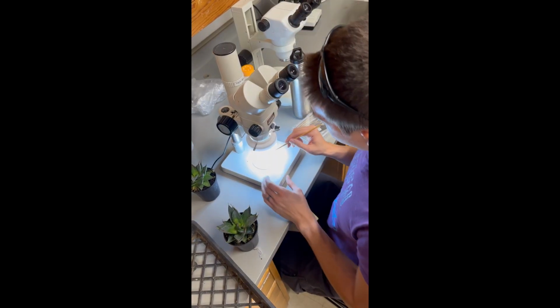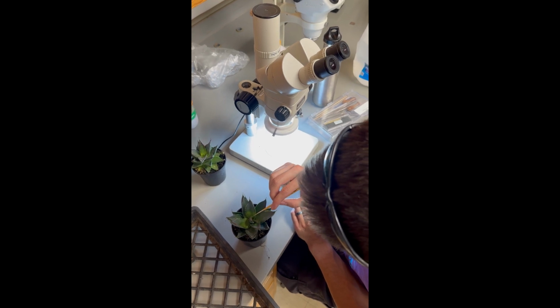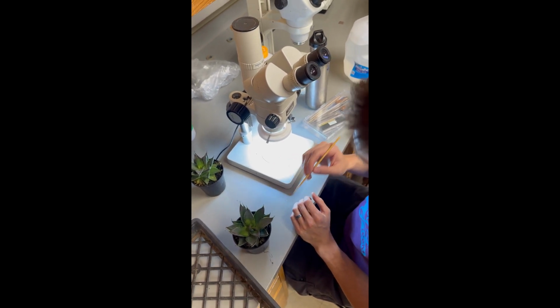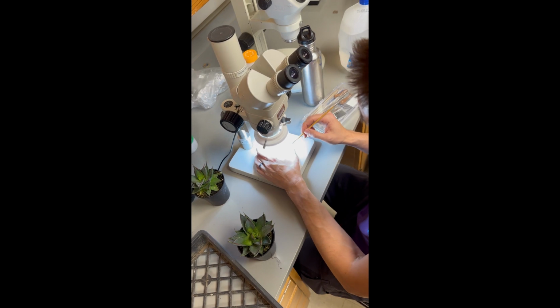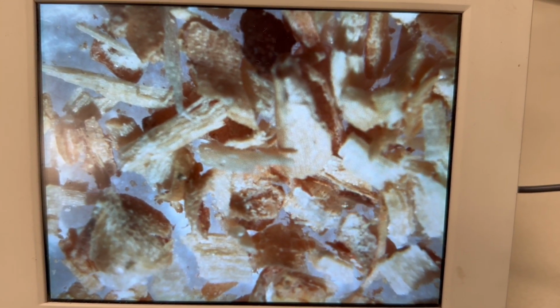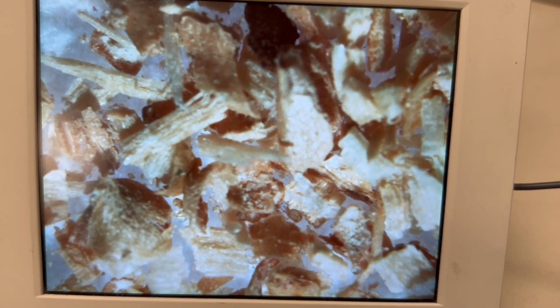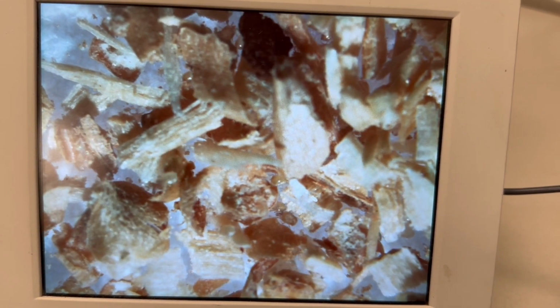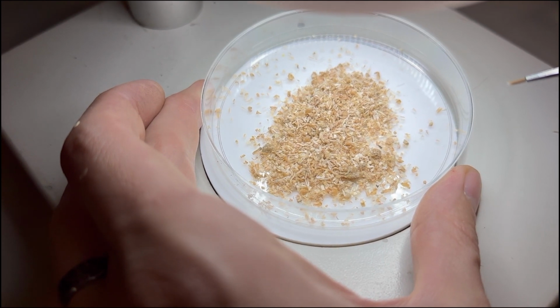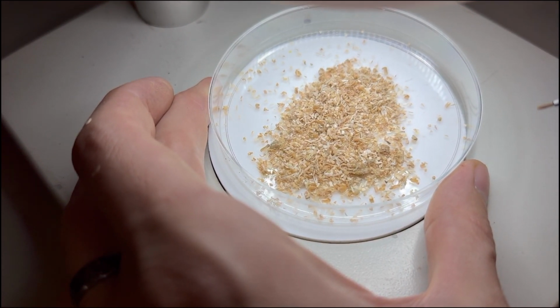So right now, it's numbers 5 and 6, transferring 20 of the Swirsky mites onto each one of the infected agave. They come in this kind of medium, which normally you will sprinkle out onto the different crops that you want to be putting the predatory mites on. And so I'm picking through that and trying to find the individual mites, which are very small. You might be able to see some tiny little bits of movement, but for the most part, they're really only visible through the scope. If you happen to get one out and separate, you will still be able to see it with your naked eye, but they're quite small.